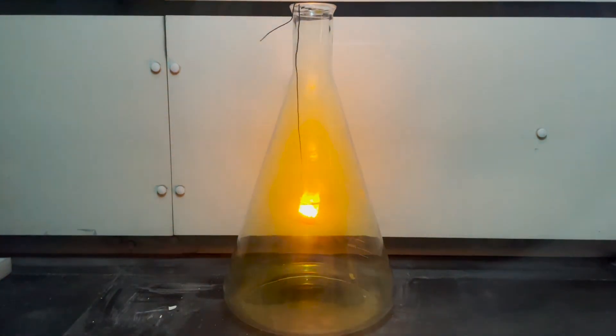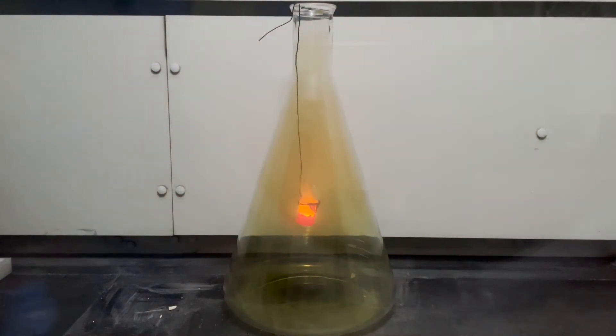This time, the reaction really gets going. As the sodium and chlorine react, they give off something that looks like smoke. This is actually a suspension of very fine particles of sodium chloride. I really like the way the smoke kind of forms tendrils down at the bottom of the flask here.